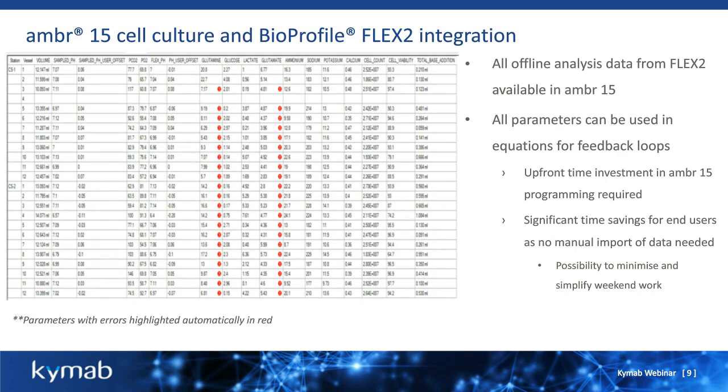All of the offline data that we saw in the previous slide from the FLEX2 is automatically imported into the ambr software, as you can see from the table here. And these parameters can then be used in equations for various feedback loops. Obviously, to enable this, you'll need to invest some time in terms of ambr15 programming. But once that's done, there can be significant time savings for end users, as no manual import or manipulation of data is required. And this means that it is possible to minimize and simplify weekend and out-of-hour working.